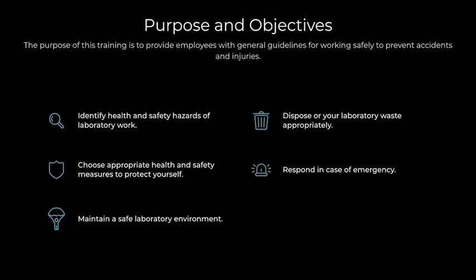Choosing appropriate health and safety measures. To protect yourself from these hazards, it is important to wear appropriate personal protective equipment such as gloves, goggles, and lab coats.